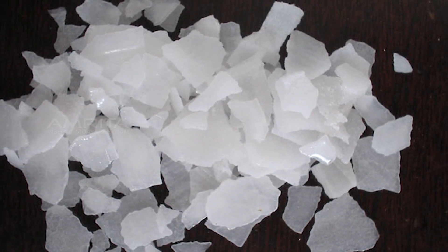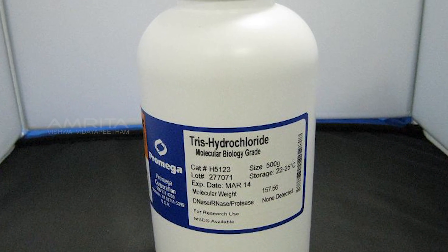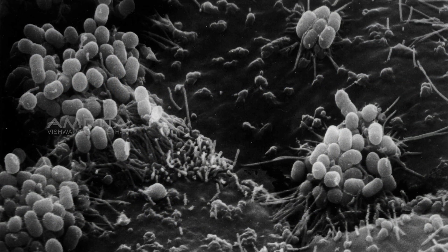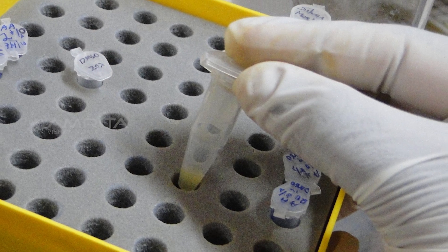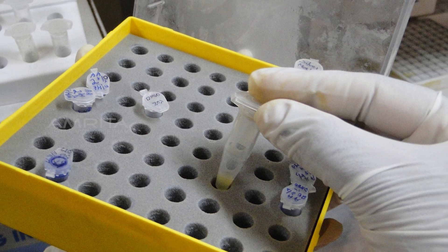This method uses a few reagents such as hot NaOH and Tris HCl in order to extract DNA from the cell. The cell debris is removed by a round of centrifugation. In conclusion, this method is rapid, reliable and cost efficient for the isolation of PCR ready DNA.